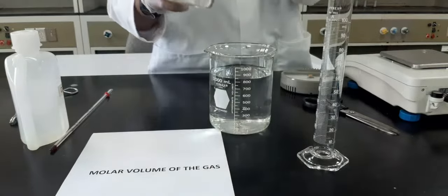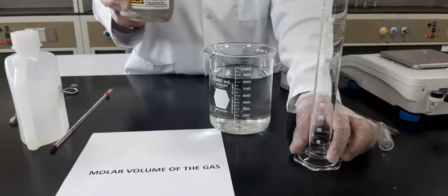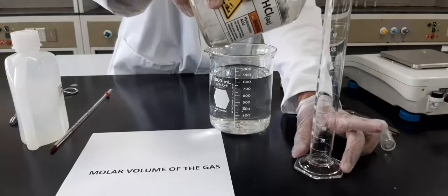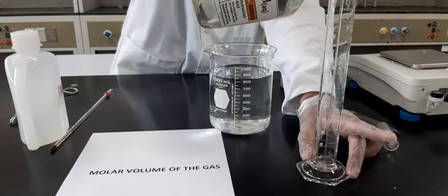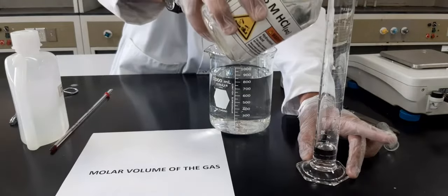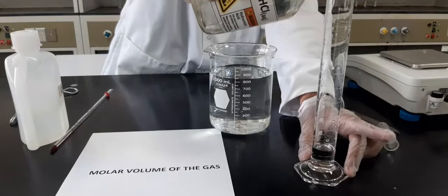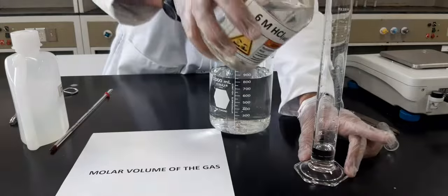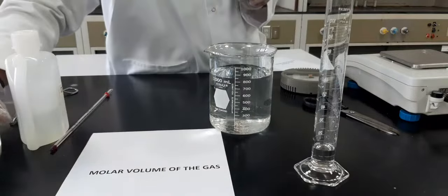Going on with the hydrochloric acid, I'm going to add 15 ml into the measuring cylinder. We have got almost 15 ml hydrochloric acid in our cylinder.